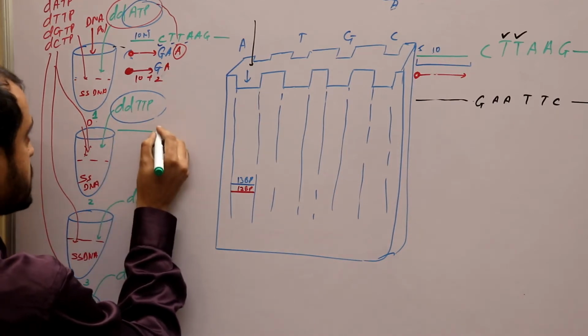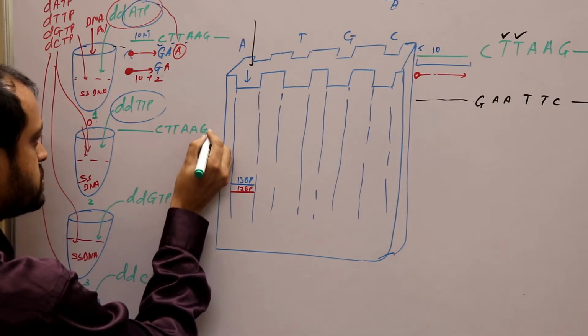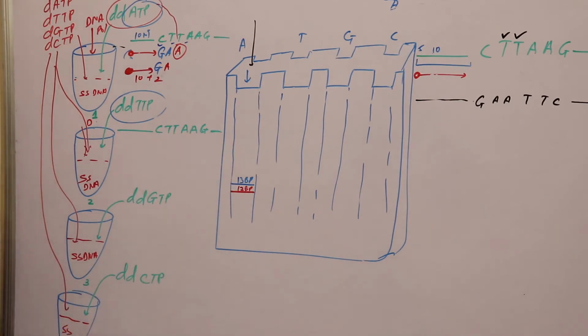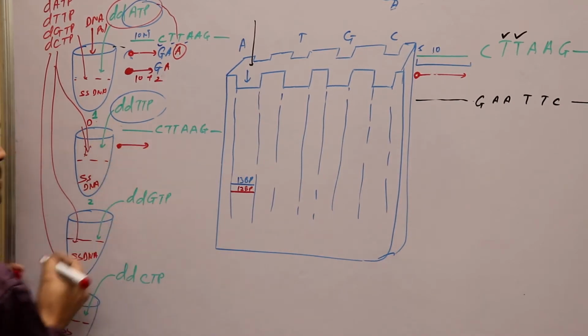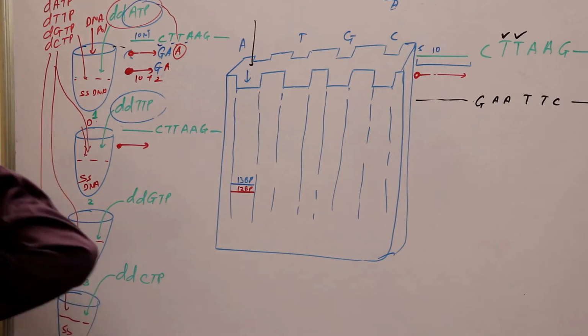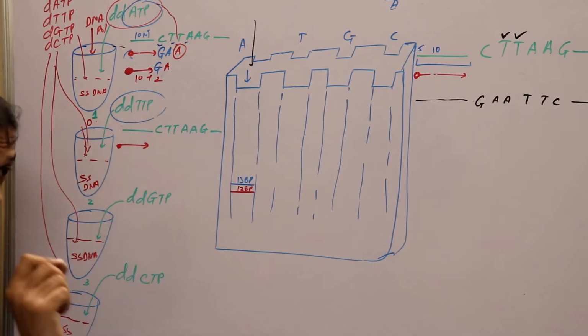During exam, always write this, the known sequence. That means the sequence you are about to be sure of. Now listen with all your attention. Suppose this is your primer. Whenever T will be present, there is a chance of getting what?